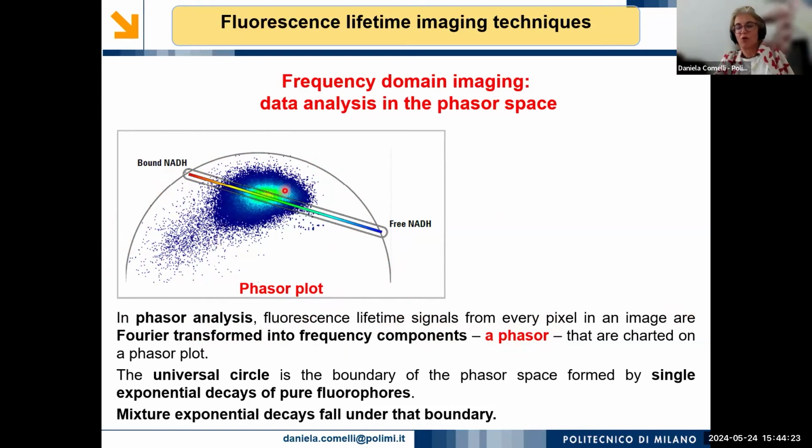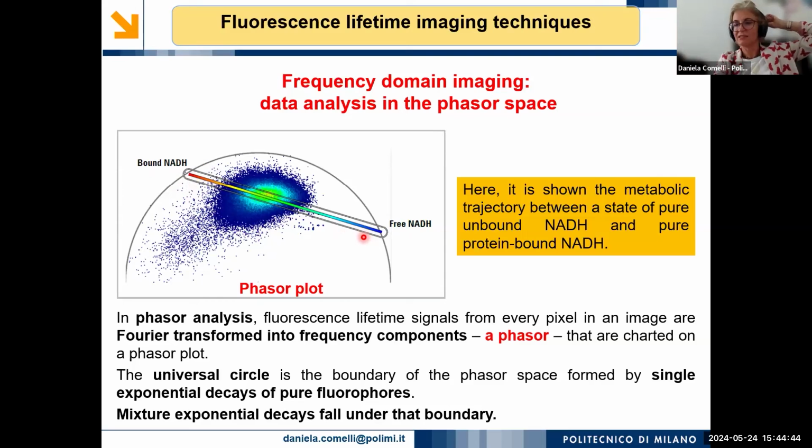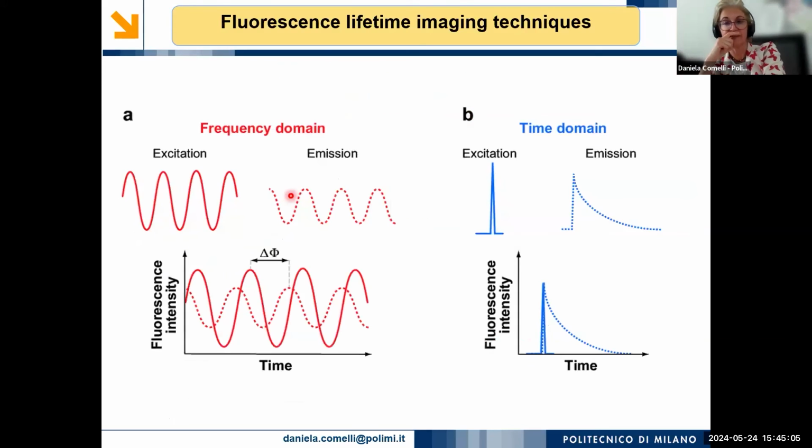components, but actually often our compounds are characterized by a multiplicity of lifetimes. And so we can see how they can be correlated with the movement from one component to another one without any need for a real mathematical modeling. This is, for example, an application to NADH, where you can see the transition in lifetime between unbound NADH and bound NADH, and this is the measured population. So we can try to provide an interpretation of our data, even visually, in this way, okay?